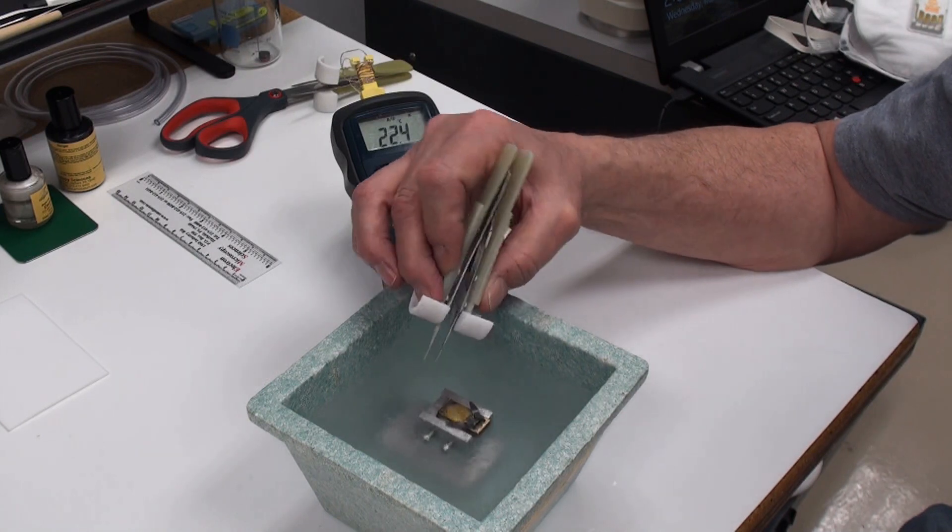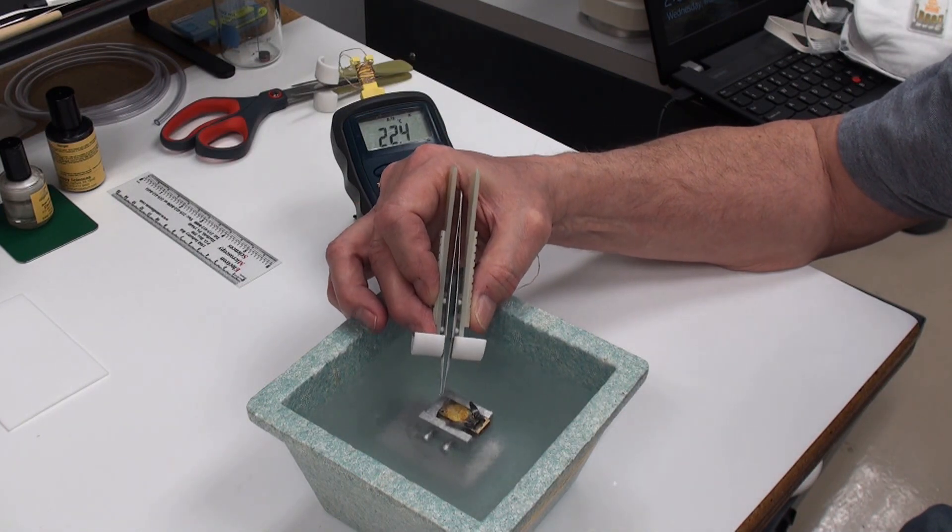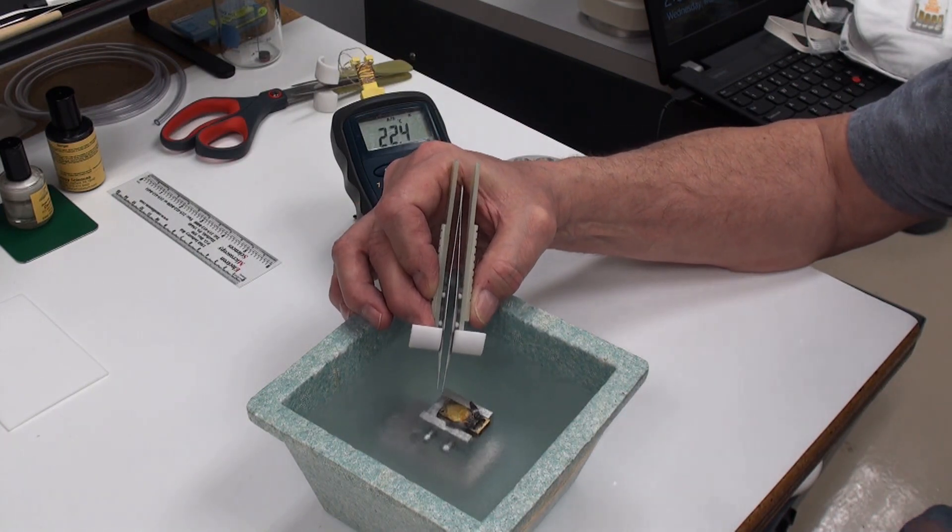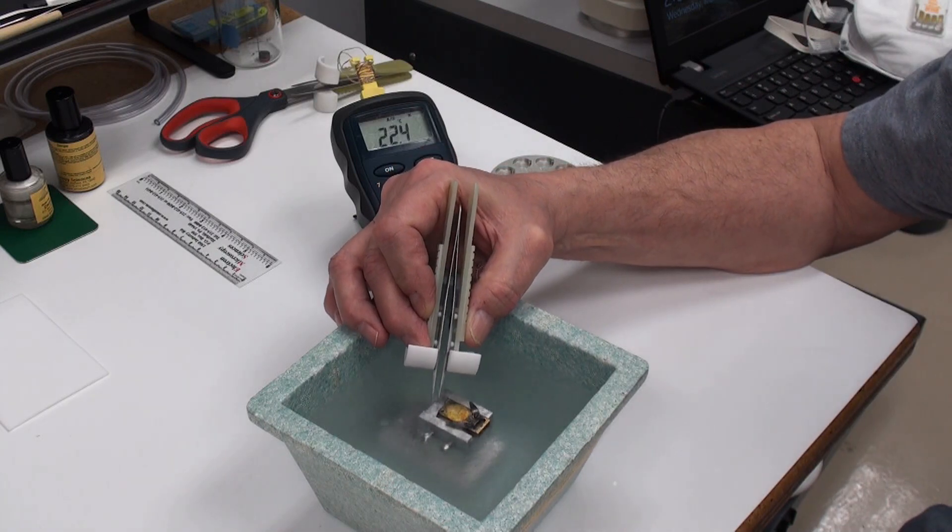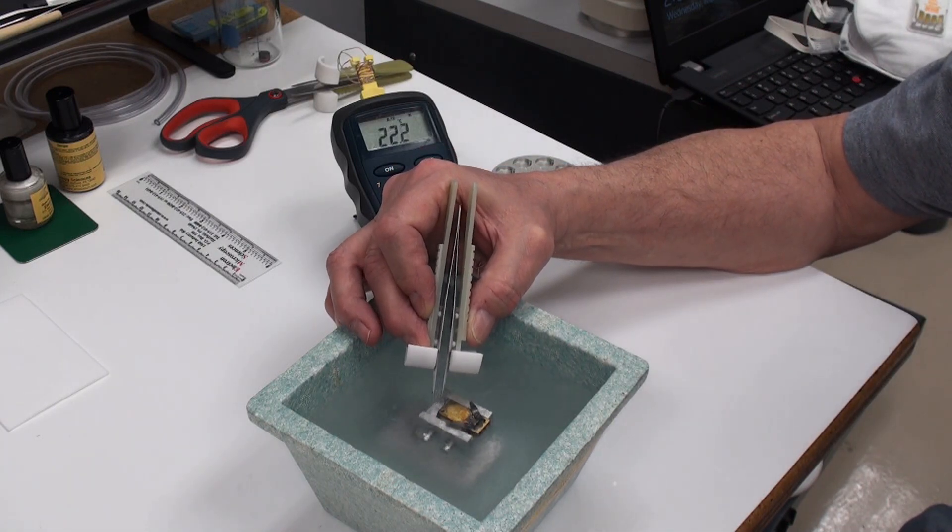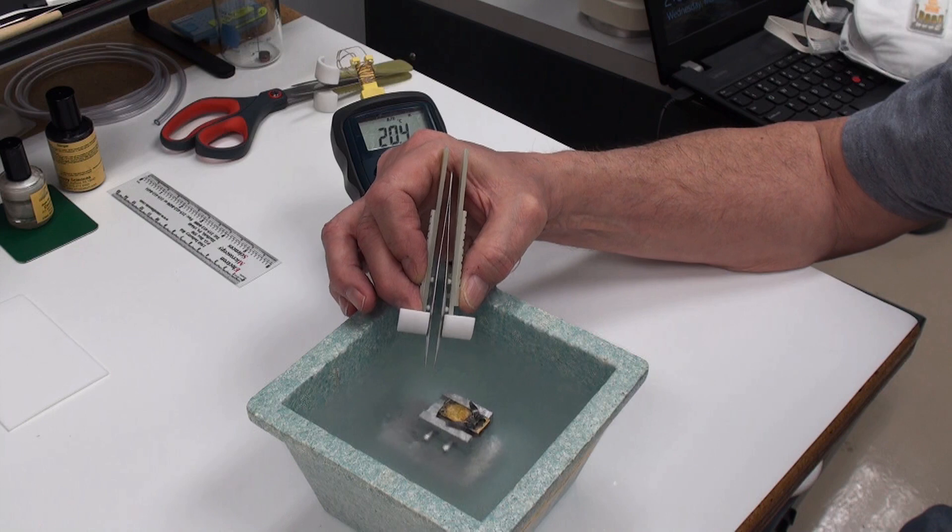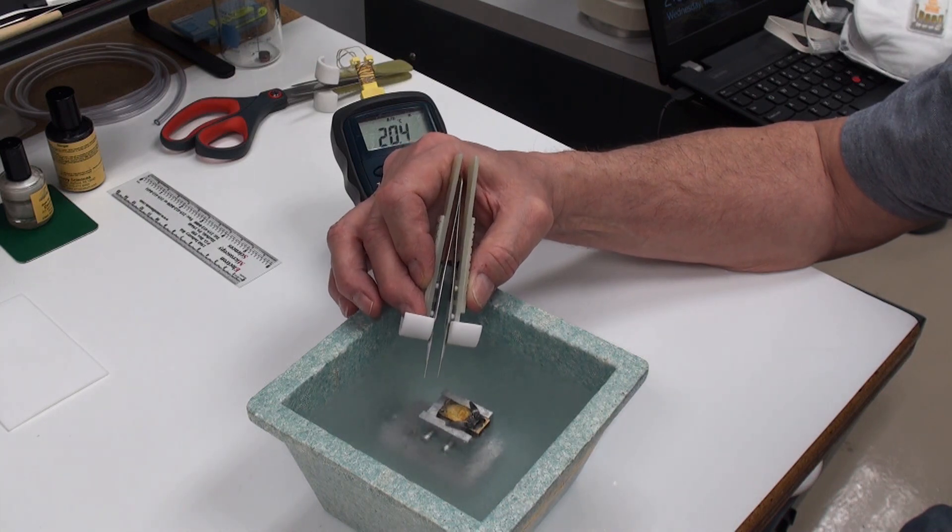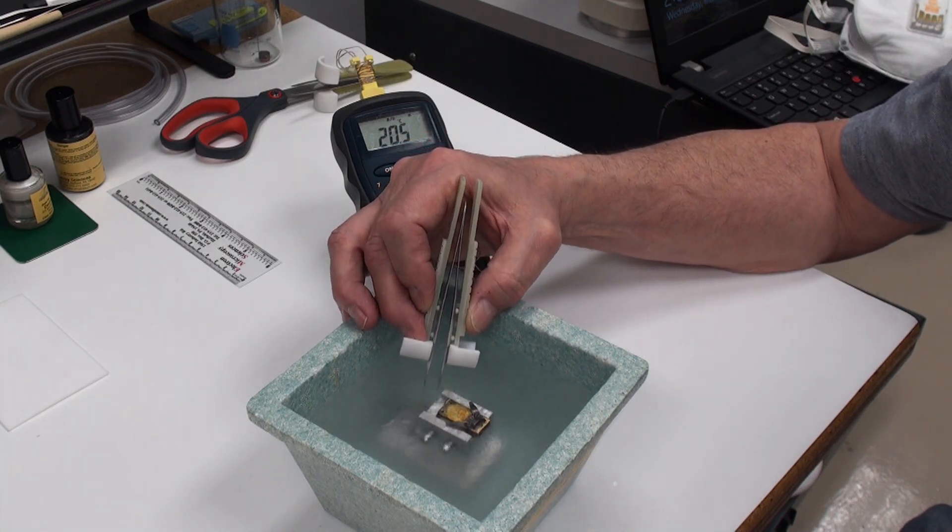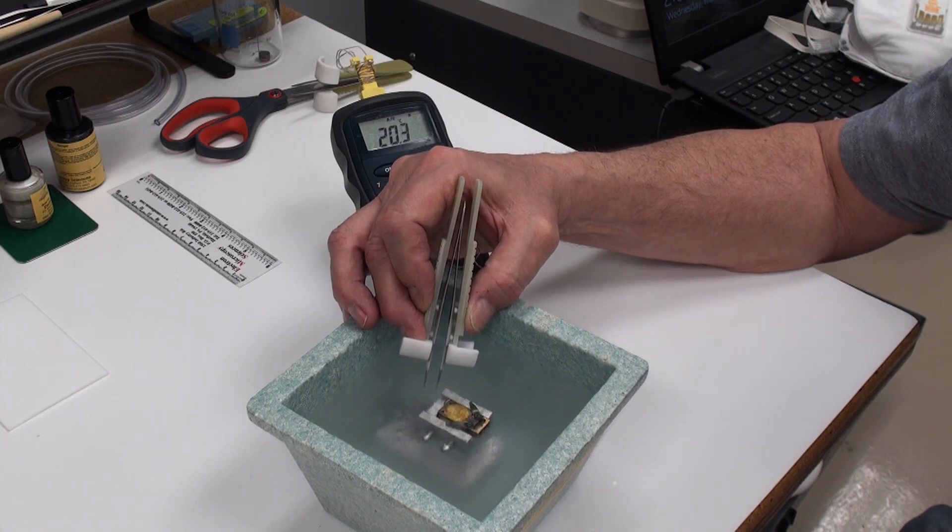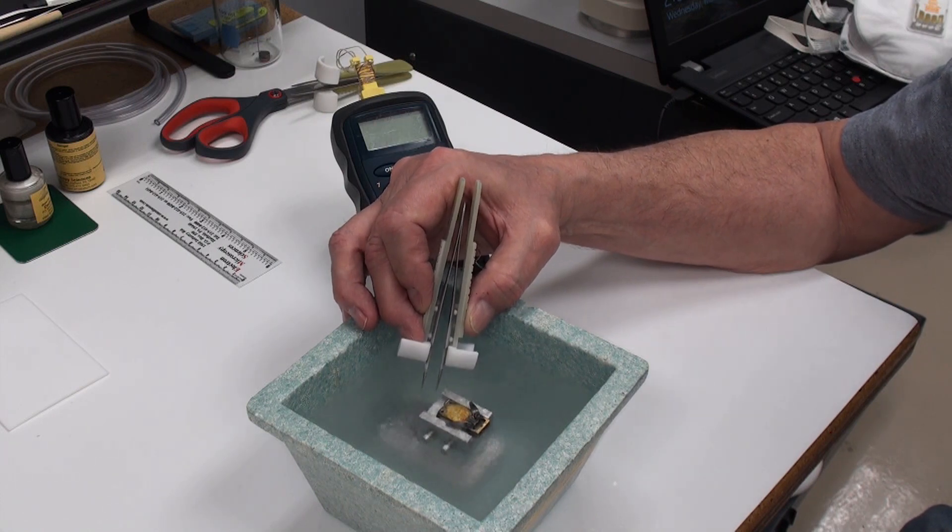These are Teflon finger guards, so you get a little bit more shielding, but you can see on the meter that the temperature is staying quite stable. Now of course you need to not immerse your whole fingers in there, but you can get quite low.